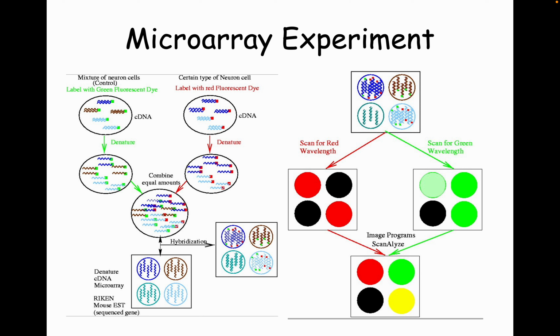Now, these experiments are kind of expensive. They'll run from a couple $100 to a couple $1,000 with analysis. So you would want to do some other bioinformatics before you just go and slap a new protein on there and say, maybe it's a kinase. You would want to see some sort of other confirmation that it looks as though it might be a kinase. Yeah, you can do things like this. Binding, enzymatic modification, addition of particular modifications like glycosylation. All of these things exist as different microarrays.